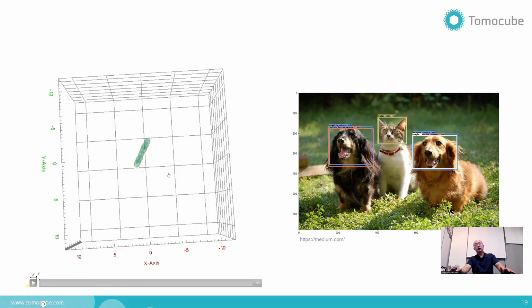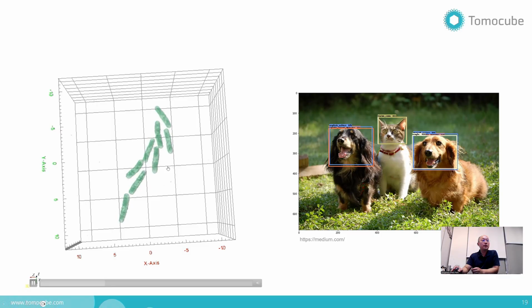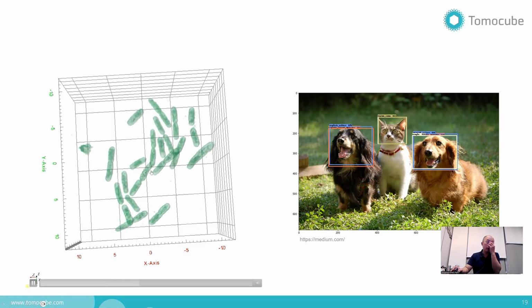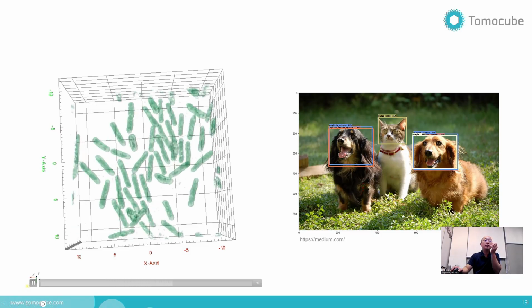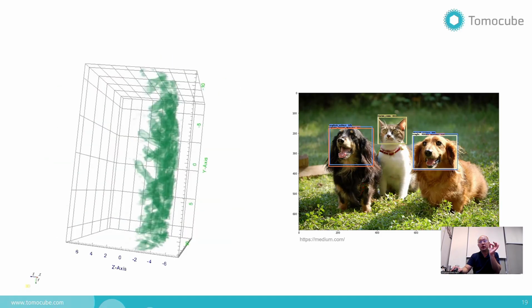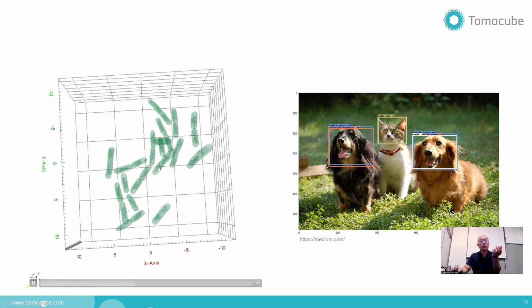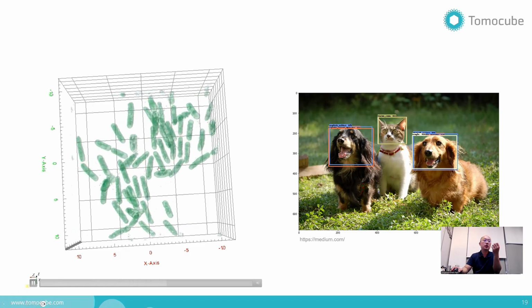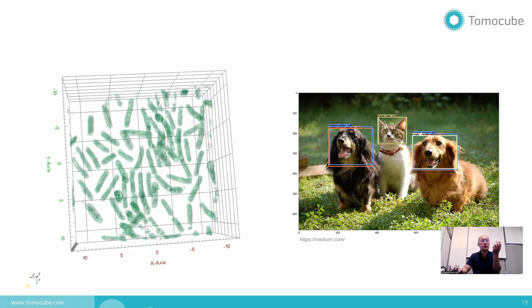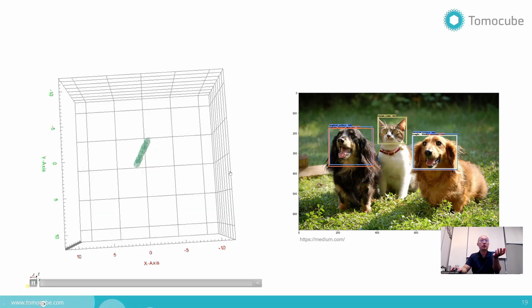The second application is classification. It's like finding which one is cat and which one is dog. After measuring these bacterial movies, we realized that we may be able to differentiate the different bacterial types, because we can access the internal distributions of proteins and biomolecular content by retrieving the 3-dimensional distribution of refractive index.